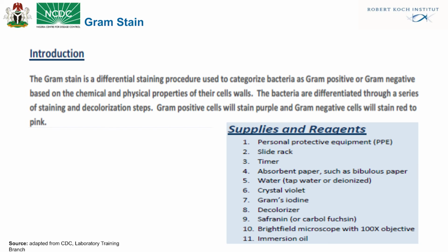Then the counterstain could be either safranin, neutral red, or dilute carbol fuchsin. And of course a bright field microscope with a 100x objective and immersion oil.